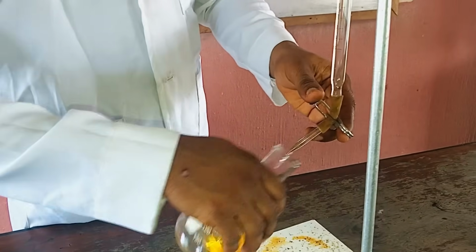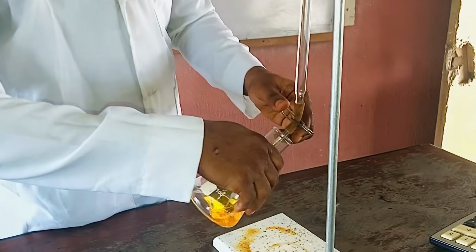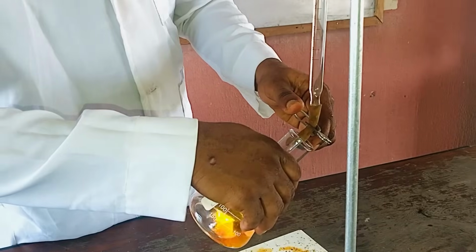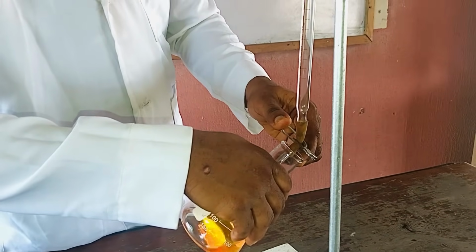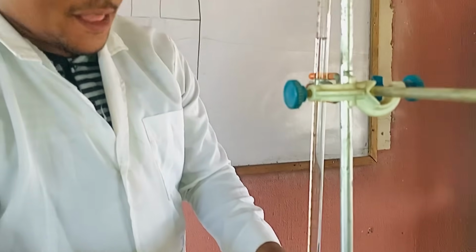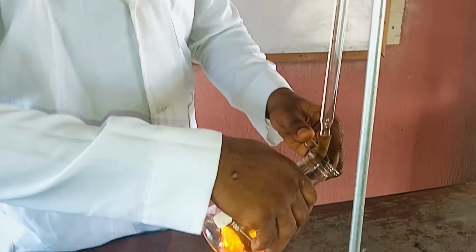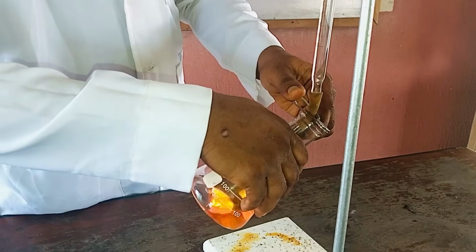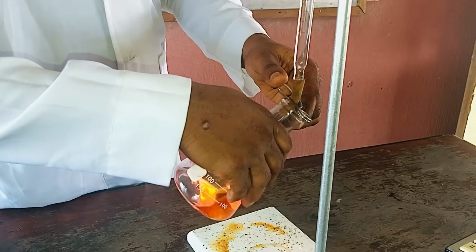Then we titrate again, very important now. We already know the range, so we don't need to worry ourselves. Our rough and our first titration has given us the range, okay? So you can see, it's beginning to actually change color. Very important, you can see that. You need to see the color change, okay? Can you see that now? Very important. So let's take the readings.